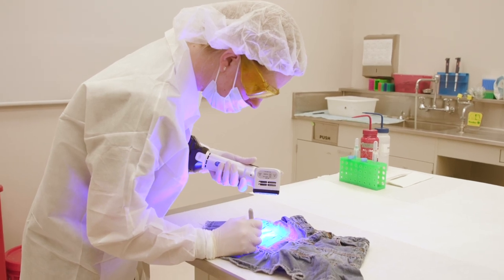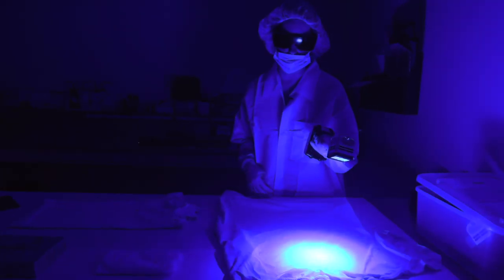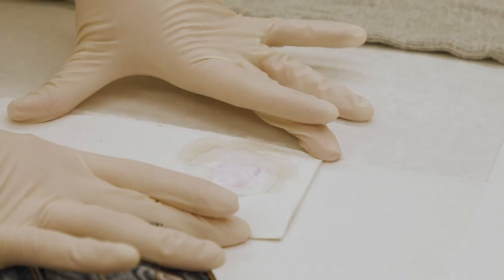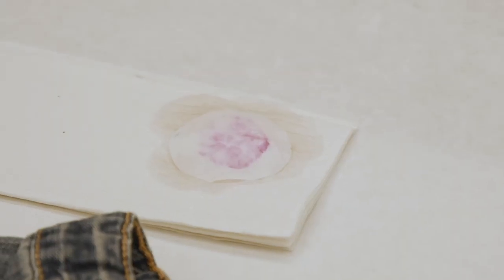One of the most visible tools familiar to CSI fans is the alternate light source or ALS for short. This device can be tuned all across the light spectrum to discover materials that might reveal clues like blood and other bodily fluids on clothes, which in turn paints a clearer picture of the crime and persons involved.